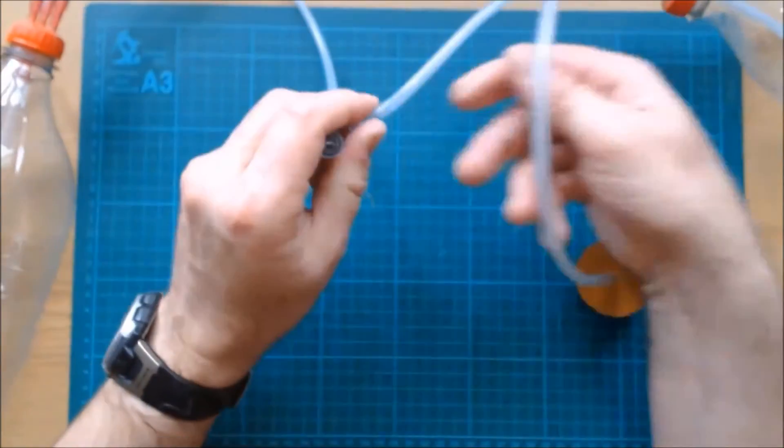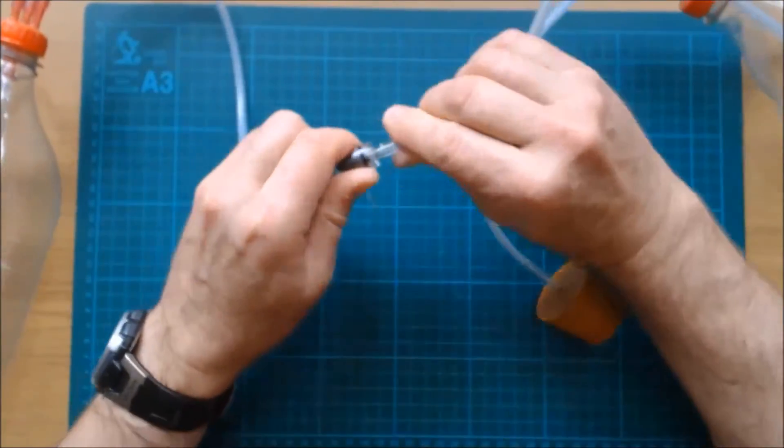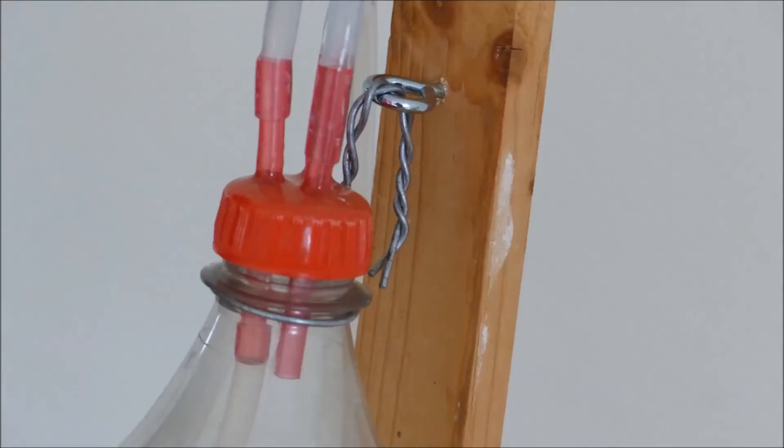Finally, connect the output pipe from the gas generation bubbler to the non-return check valve. Attach the soda bottles to a length of wood using screw eyes.